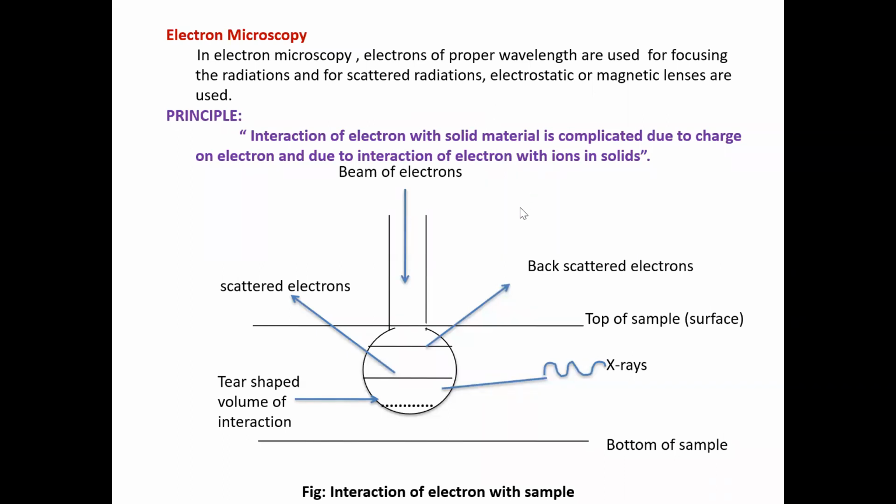So friends, in the XRD diffraction technique, we know it is a simple technique. We pass X-rays, a wavelength, which interacts with your sample. Some part of this light, this wavelength, is absorbed, some is reflected, and some is scattered. So there is scattering of light, and angles are made with the sample.